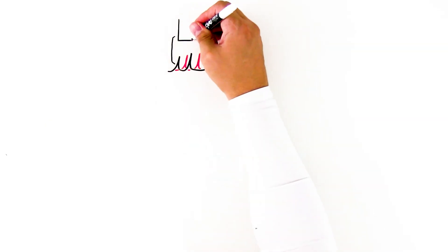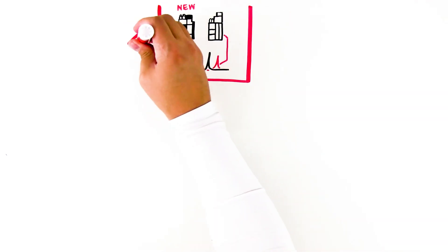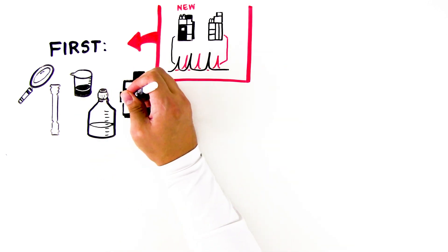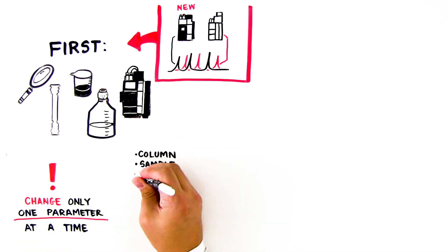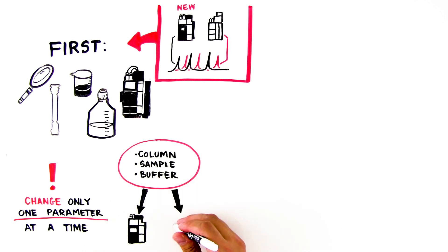If results on the new system don't match results from the original system, there are steps you can take. First, determine if the differences you are seeing are from different columns, samples, eluents, or the instrument itself. Ideally, you should change only one parameter at a time — for example, you might try using the same exact column, sample, and buffer on two different systems.